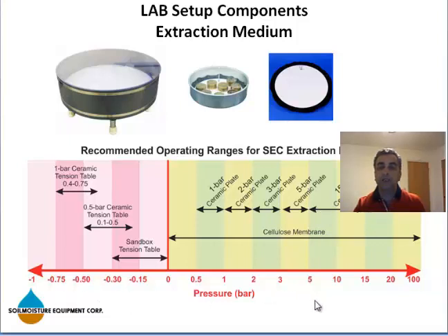Again, this slide is very useful in terms of pressure application range of our ceramics. That is a very common question that I get almost every week at least.